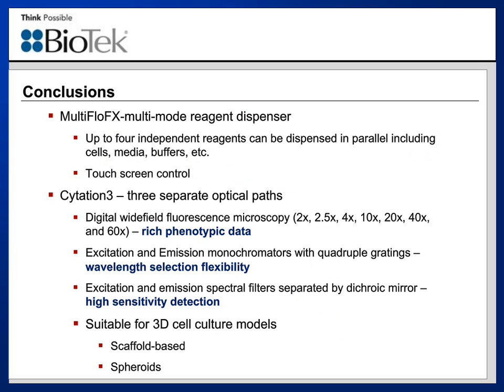And the recent development of suitable 3D cell culture models, both scaffold-based and non-scaffold-based, are available and amenable to automated high-throughput screening. These recent developments are starting to shift the way folks are looking at drug discovery.